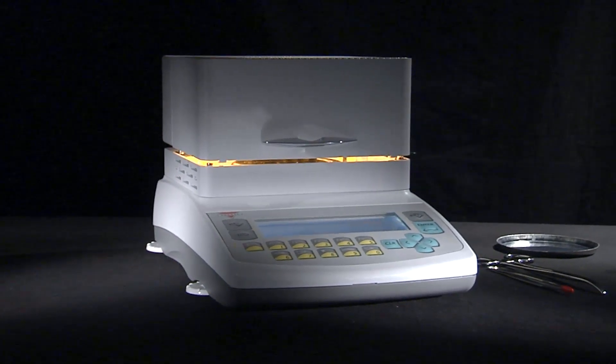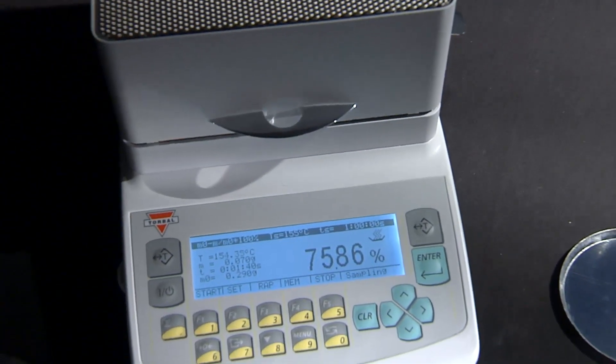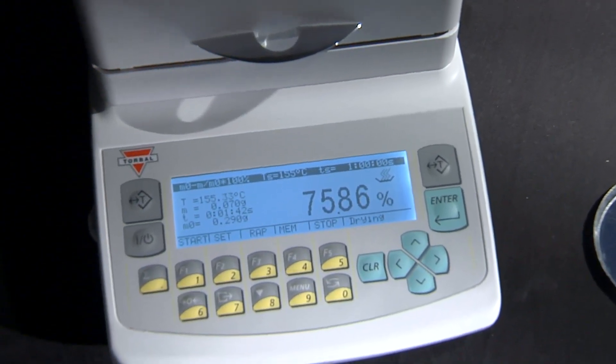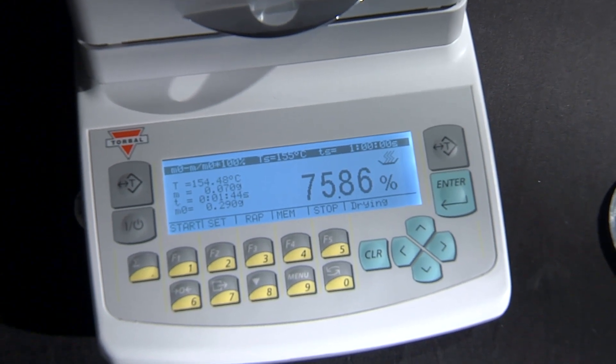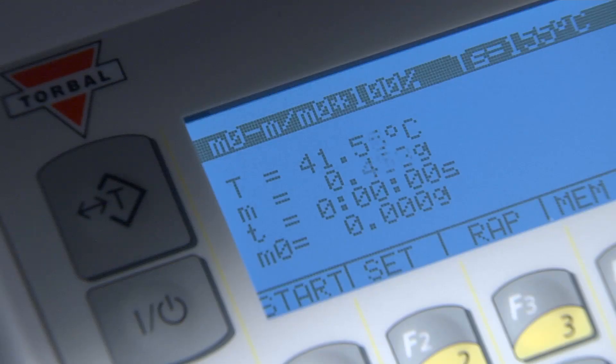The strong design provides a stable weighing platform and guarantees long operating life. Every AGS analyzer is equipped with a large graphical LCD that displays all moisture analysis results clearly, making it user-friendly and easy to read.